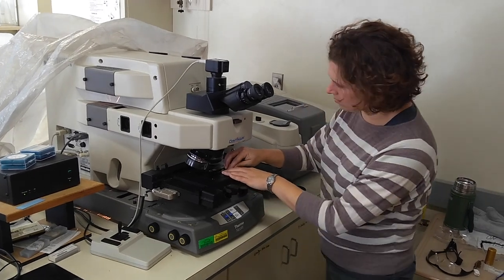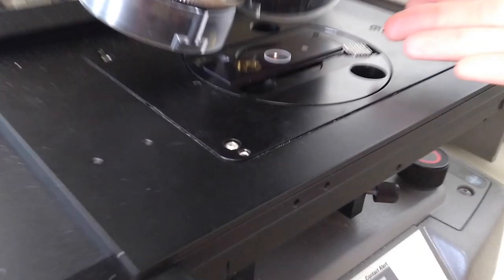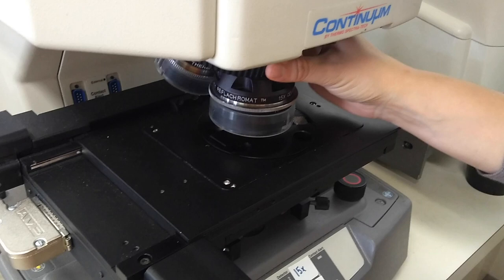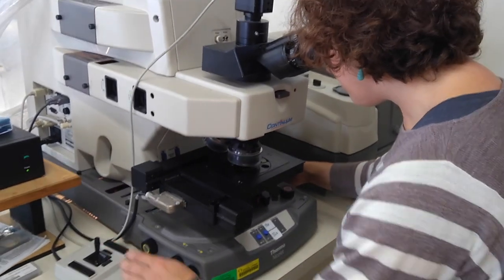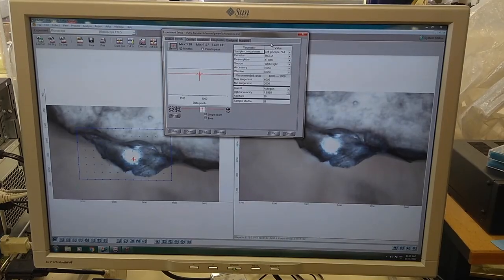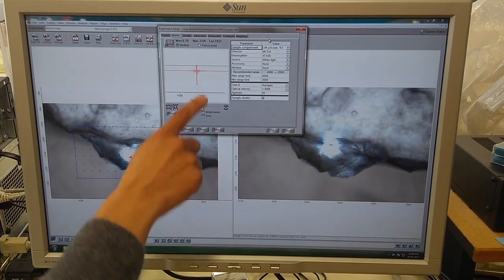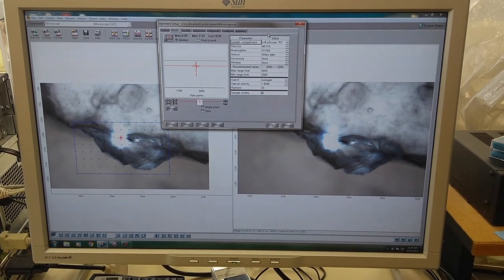This is the FTIR instrument. First, we load the sample onto a salt plate. Then we put the objective in place and we transmit infrared light through the sample, which allows us to measure water and CO2. So what's really interesting to notice as we move around here is that the signal strength shown here changes as we move around the reentrant.